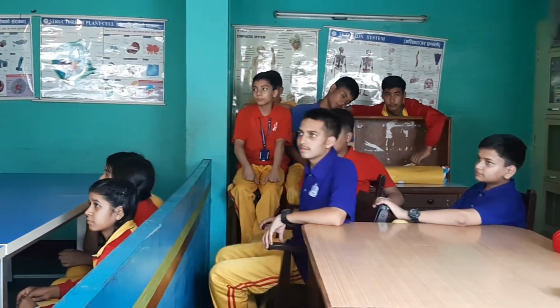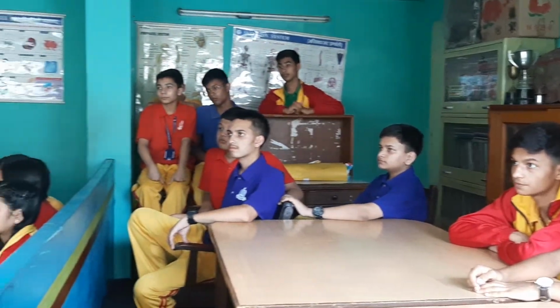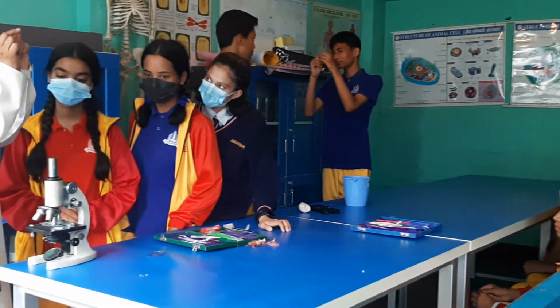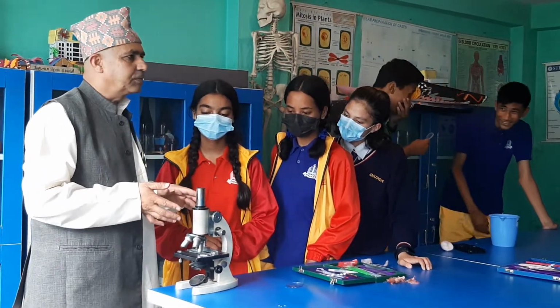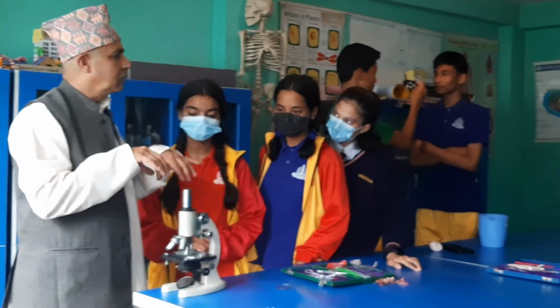Listen, boys, you have used a small eyepiece and a small objective with low power. That's why you have seen less distinct cells. And this girl asked, okay, let's change the lens. The objective is changed. Now we have got cells. Again, I will just ask you to join and check.